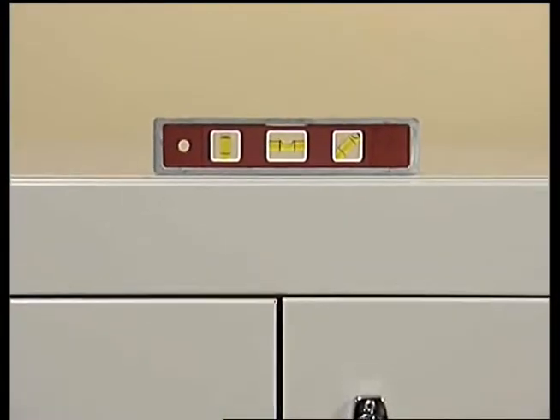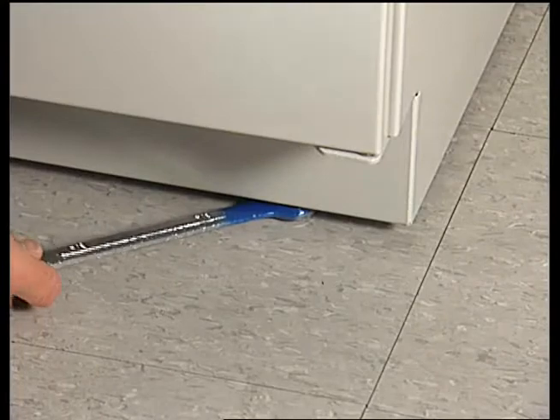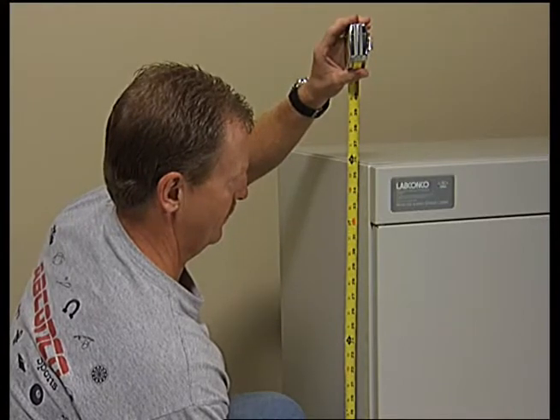Use a level to check the base cabinet at the front, sides, and back, adjusting the leveling feet as required with a crescent or open-faced wrench. Ensure the top of the cabinet is 35¾ inches above the floor.